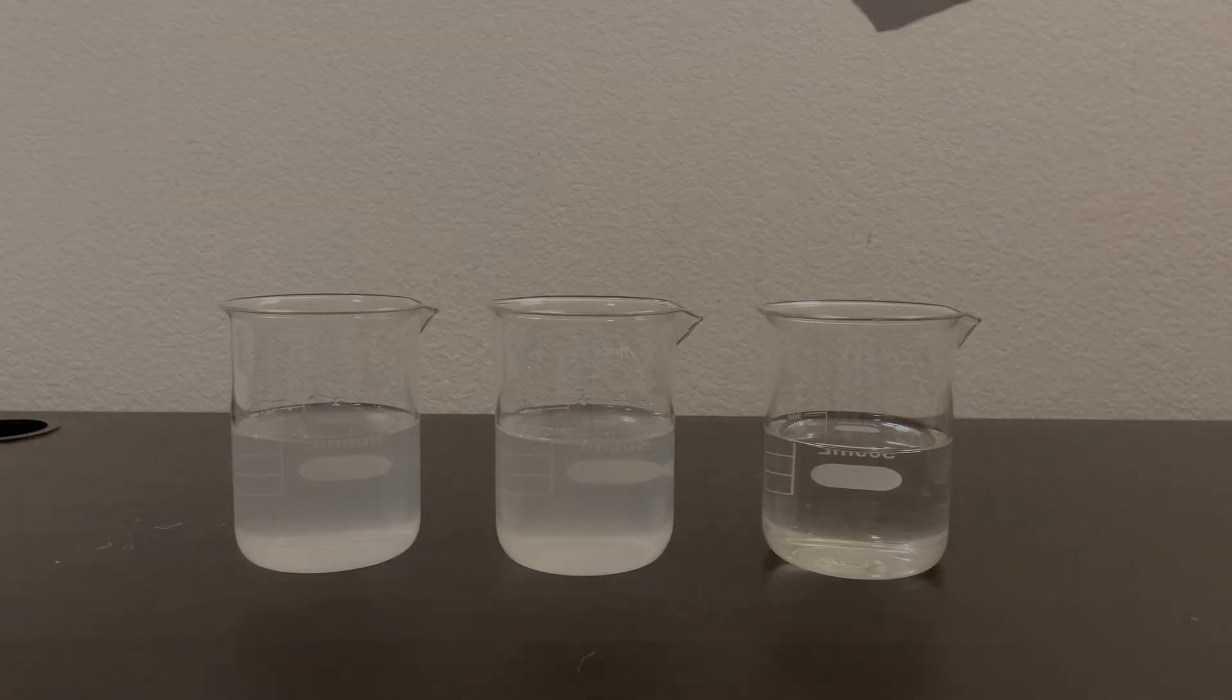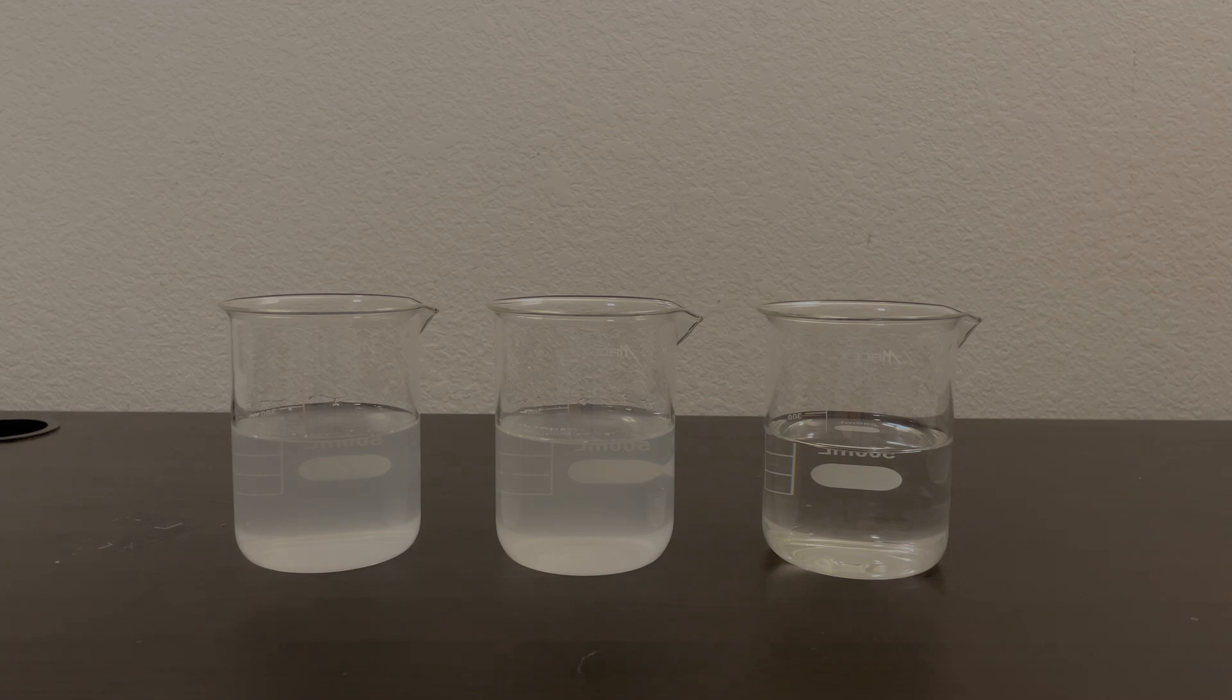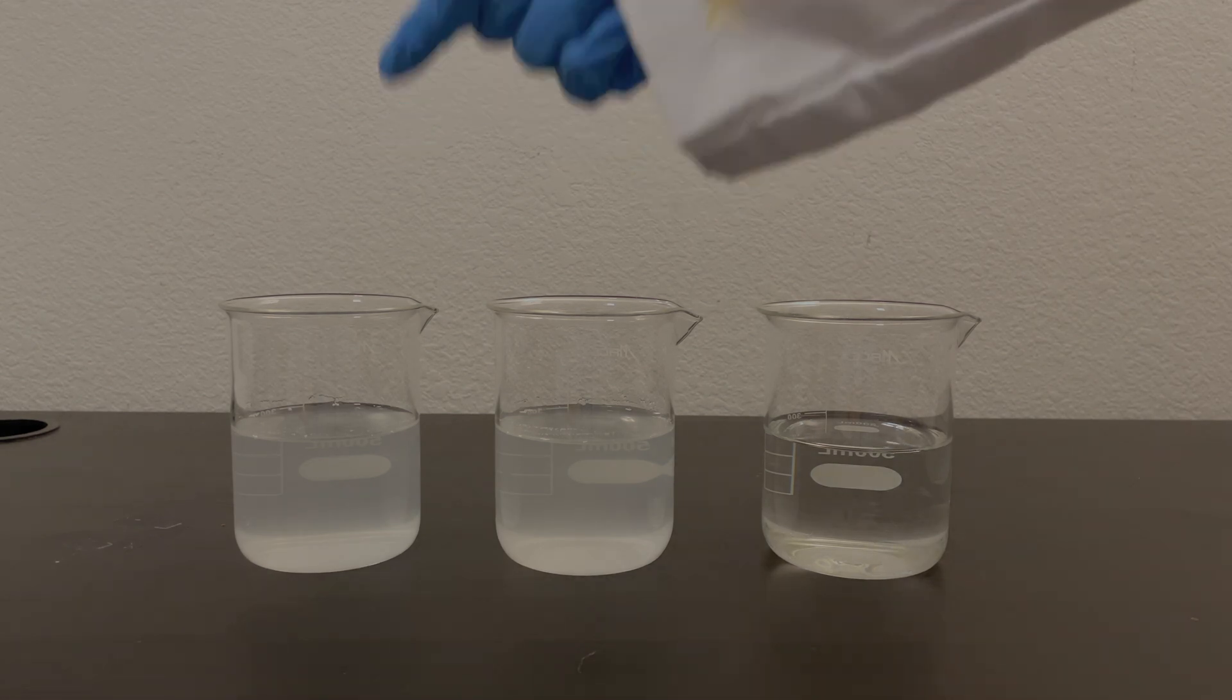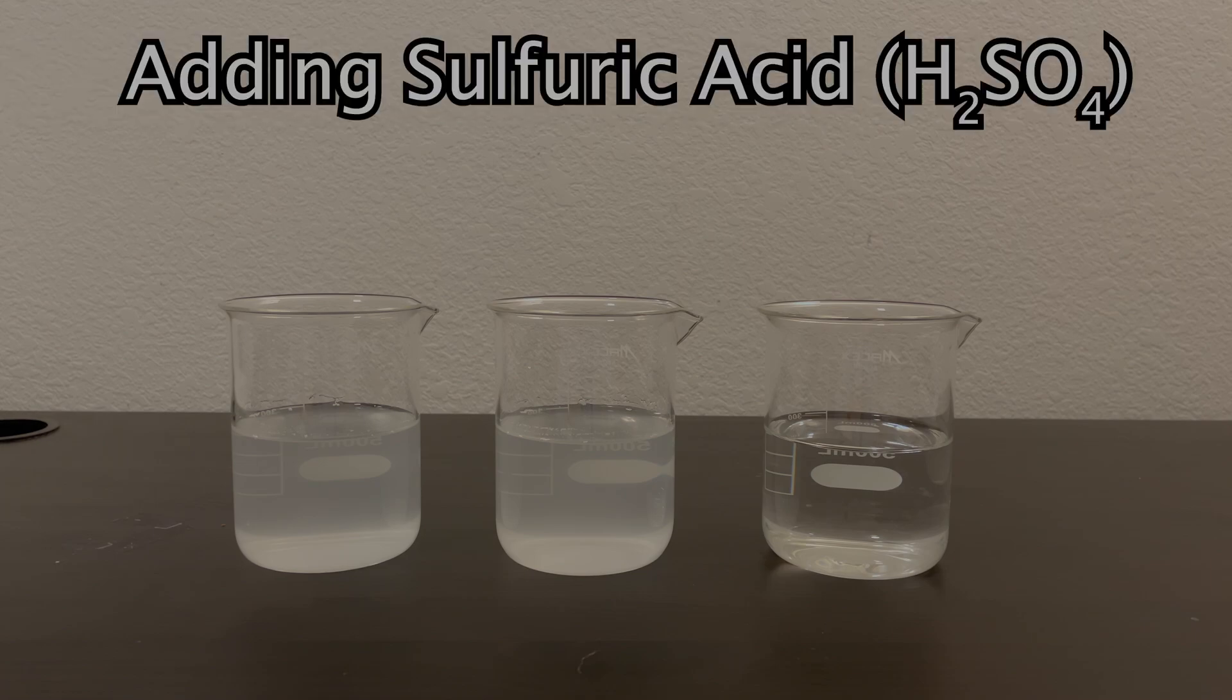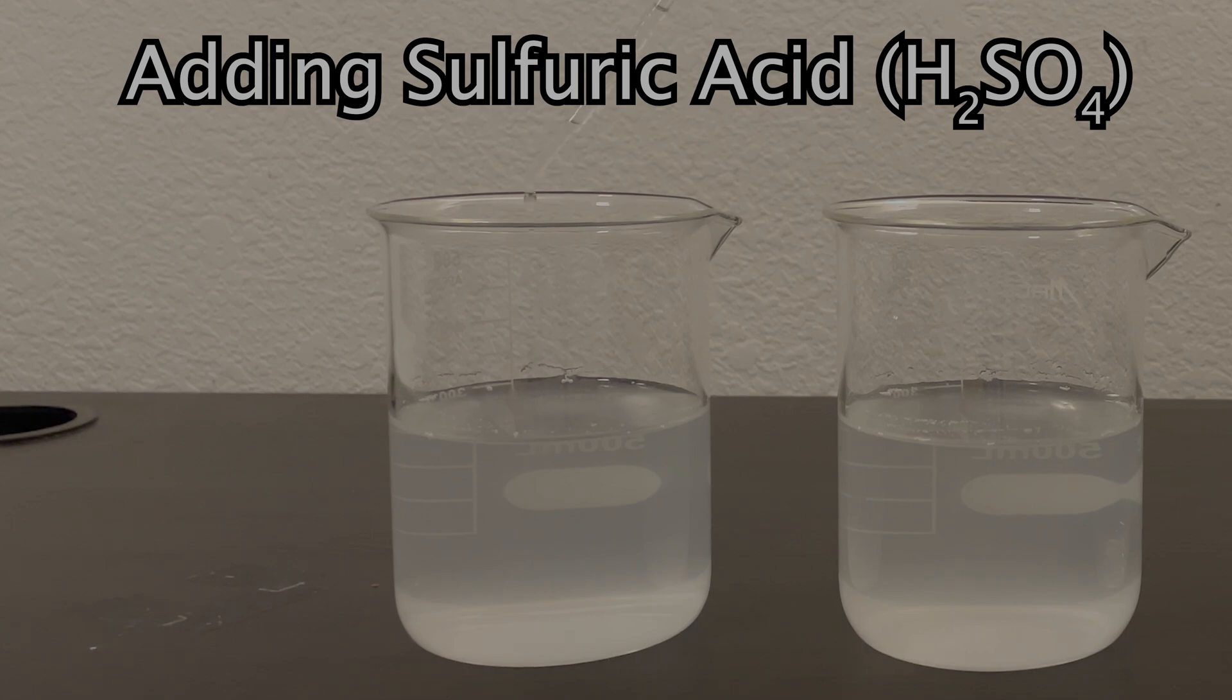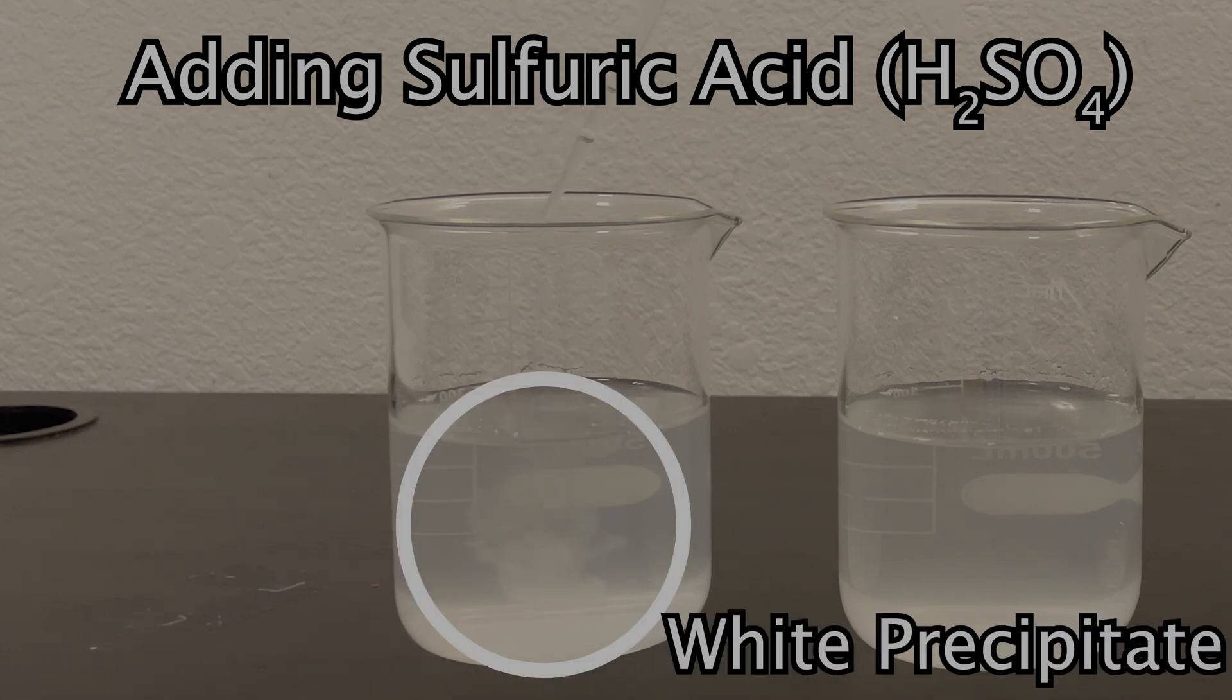Here, I've got three different beakers with three solutions. In the beaker on the left, I'm going to add a few drops of sulfuric acid. And you can see a white precipitate form.